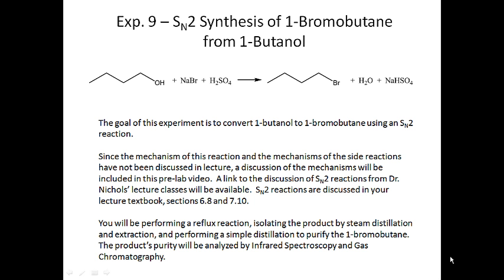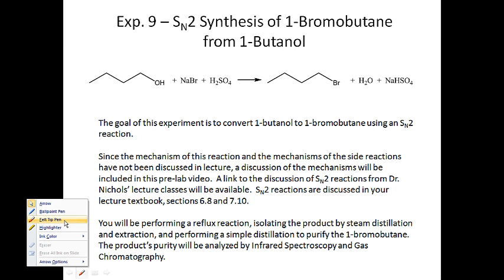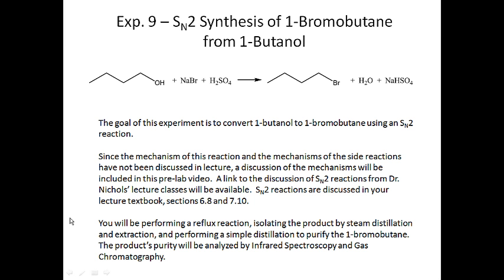Okay, this is the pre-lab lecture video for experiment 9. In this experiment, we're going to be converting 1-butanol, which is the IUPAC name for this alcohol, into 1-bromobutane using a combination of sodium bromide, which really is the bromide ion, and then sulfuric acid, which will act as a proton source for this reaction.